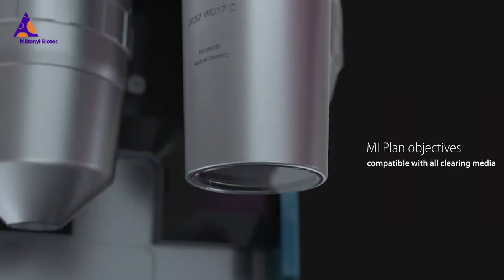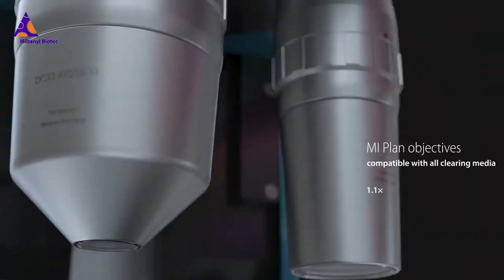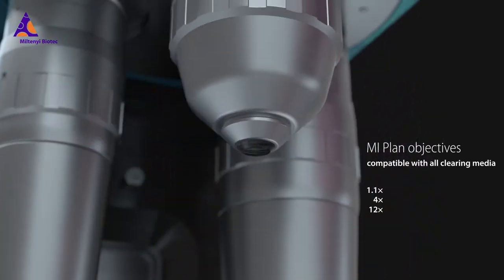MI plan objectives are available for 1.1, 4, and 12-fold magnification.